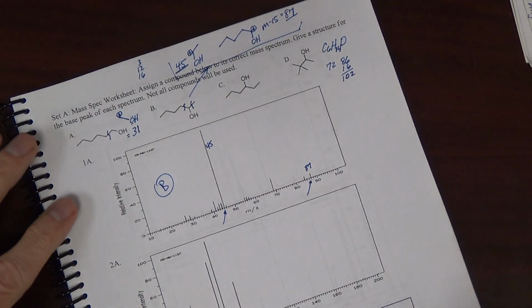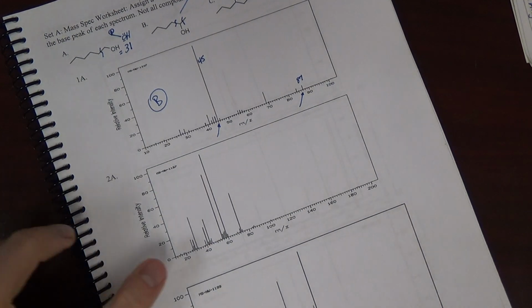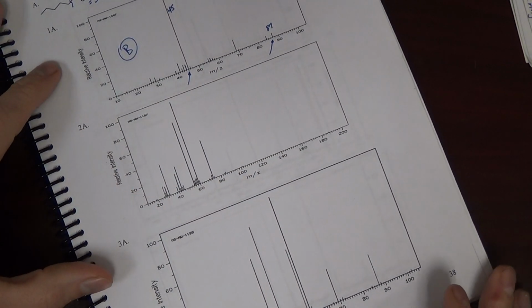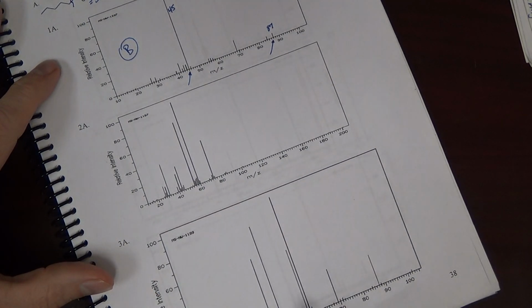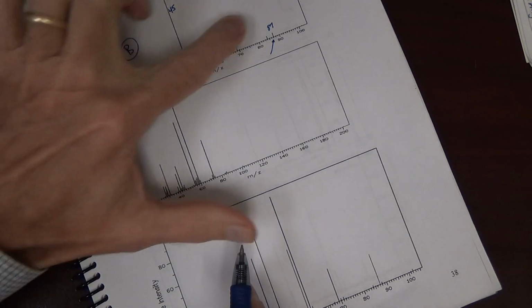Now again, we can confirm this. We can see how the other two spectra look. The other two spectra are a little noisier, I would say, not as selective. We had a single base peak up there.